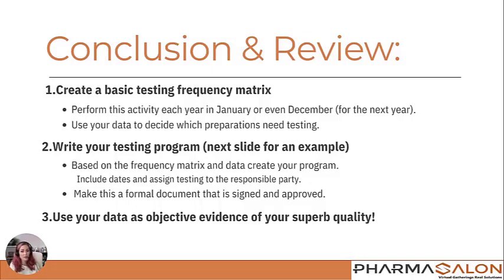You're going to base this on your frequency matrix and your data, include dates, and assign the testing to the responsible party. Make this a formal document. That way, it holds you accountable to make sure you're getting that testing done and it's staying on track. Then, use all of this wonderful objective data as evidence of your superb quality.